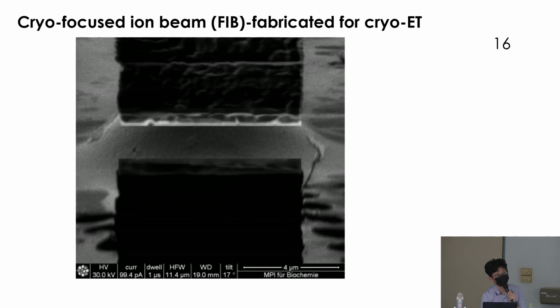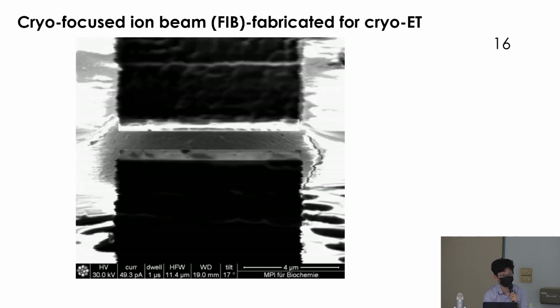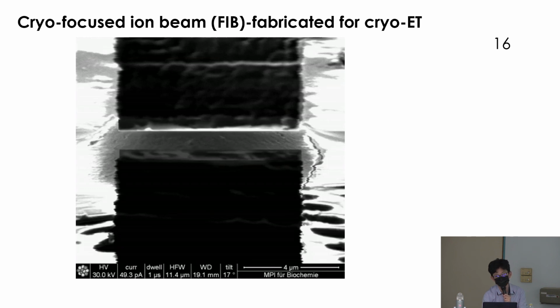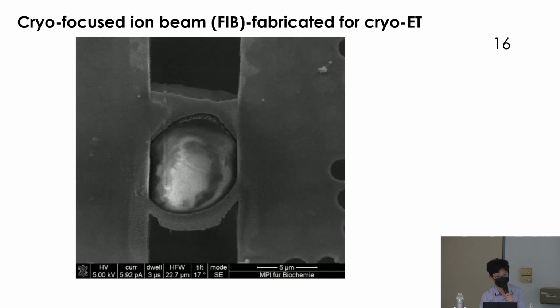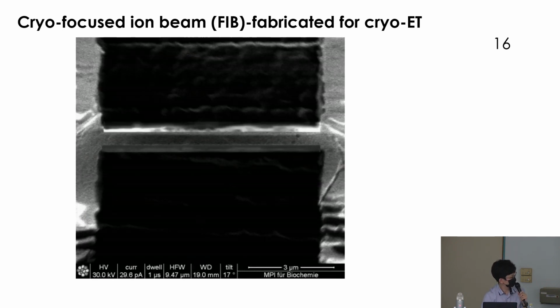So notice this. Now everything is grayish. There's no particular color. So if you want to work on the nucleus, where is the nucleus? Where is the mitochondria? Right? Now we continue to cut it.